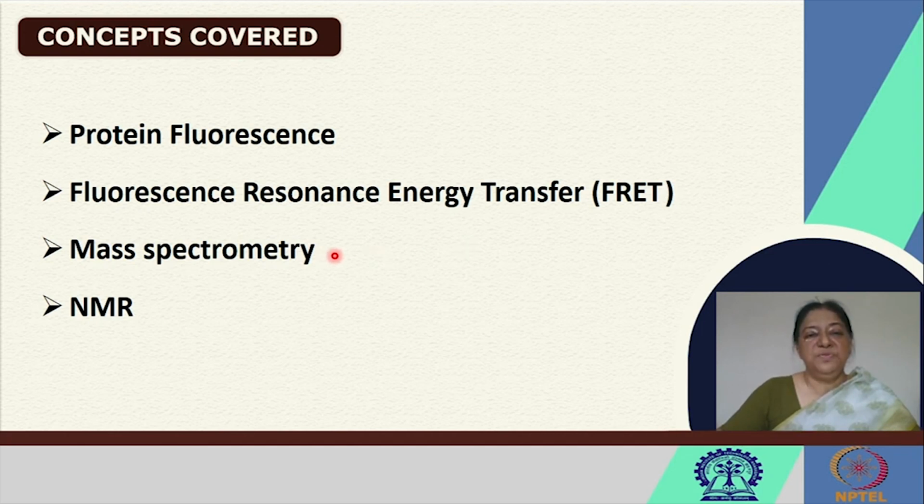We looked at a brief introduction or a brief discussion on mass spectrometry and how it may be used to determine the molecular weight from a mass by charge ratio using MALDI-TOF, most commonly used for proteins. Another aspect of protein structure prediction, but also protein ligand binding, is looking at the chemical shifts of protons or specific atoms where we will be able to identify protein folding and unfolding in addition to protein ligand interactions.